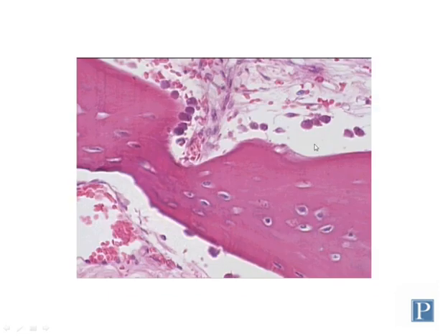Now, in some sections, you may see osteoblasts appearing to sort of hover over the surface of these trabeculae. This is an artifact of slide preparation. In fact, they normally always sit on the surface. They wouldn't be found like this. But because they're on the surface and there's nothing to anchor them down, when this tissue is sectioned, a lot of times they get perturbed and actually moved off of the surface of the bone.